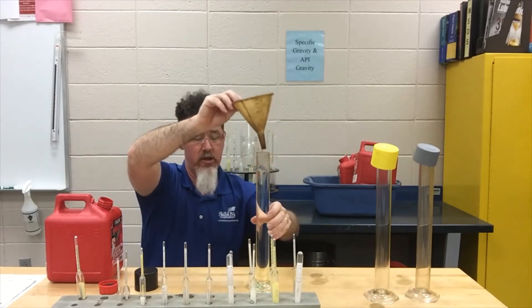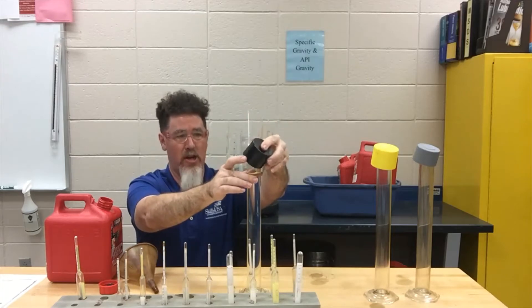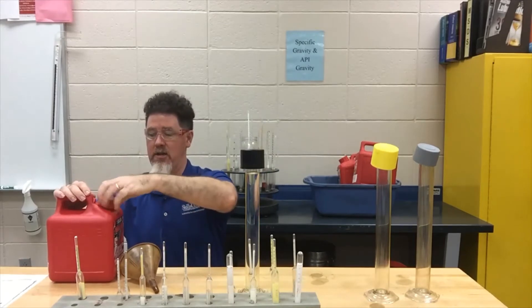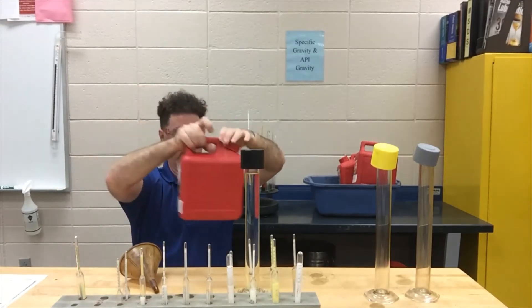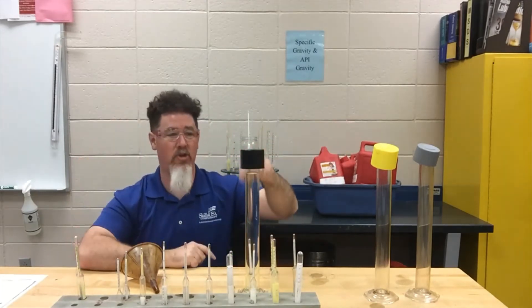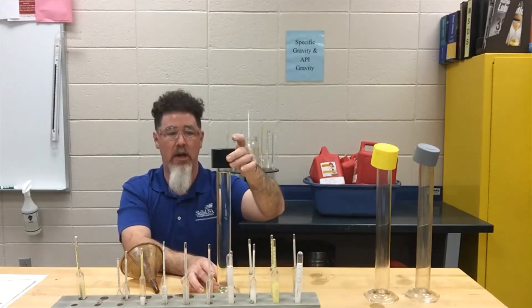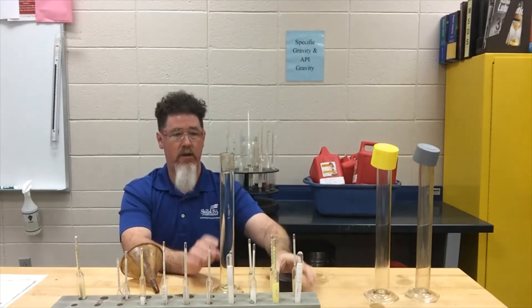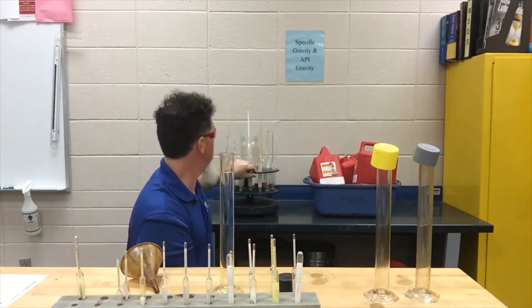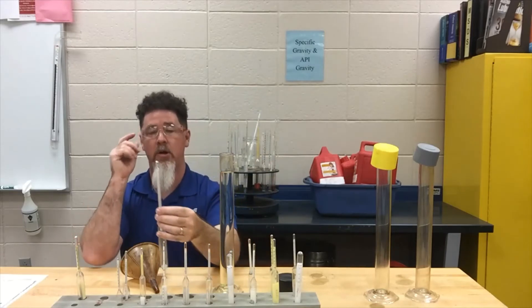With this 91 octane sample, I like to use an aerosol capsule as a cap — it's the same size as the container opening — to help keep the vapors in as long as possible. I also close up my other containers and only work one at a time, so I don't have vapors escaping from another sample while I'm checking the hydrometer on this one. Right now we're doing the 91 octane.